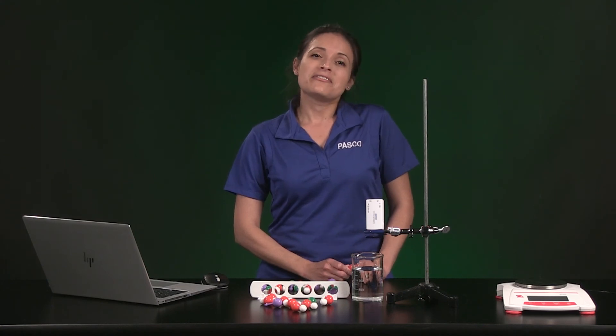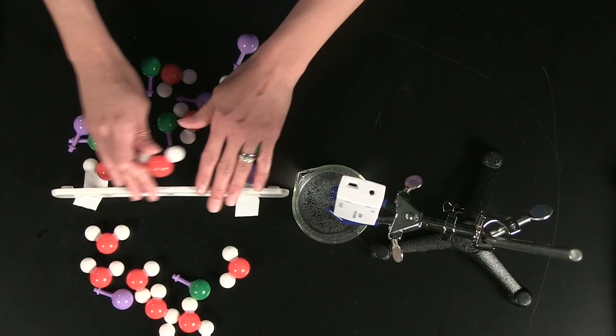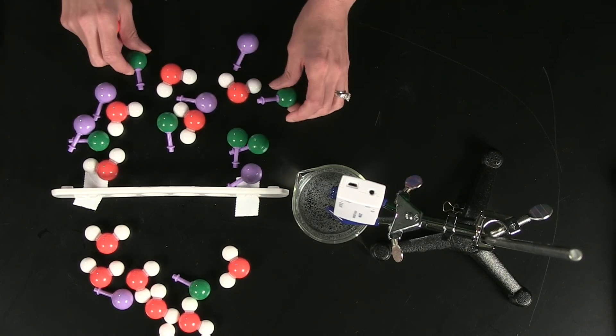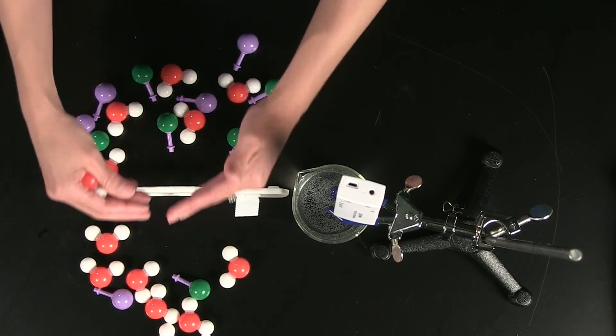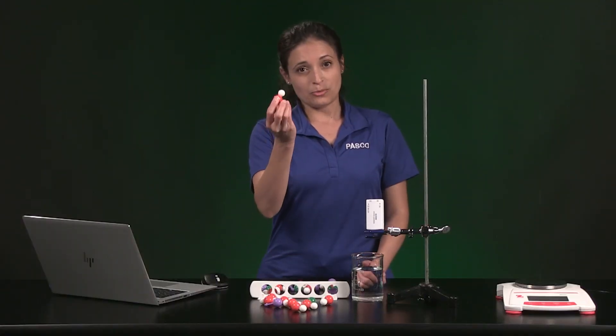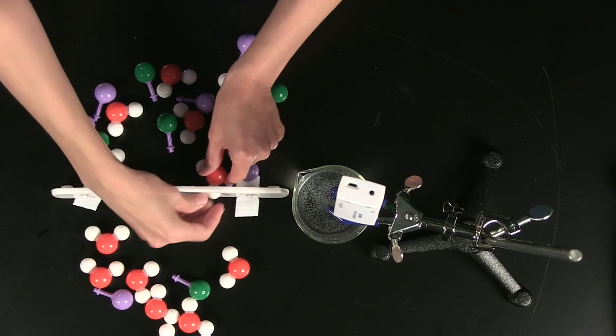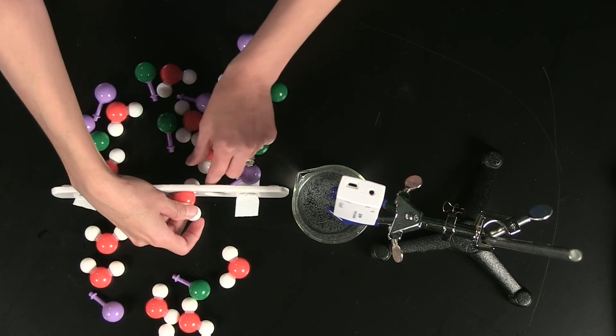Today we are going to investigate how fast water moves across a semi-permeable membrane when the concentration of a dissolved solute is different on either side of the membrane. The process of a solvent such as water moving from an area of low solute concentration to high solute concentration is called osmosis.